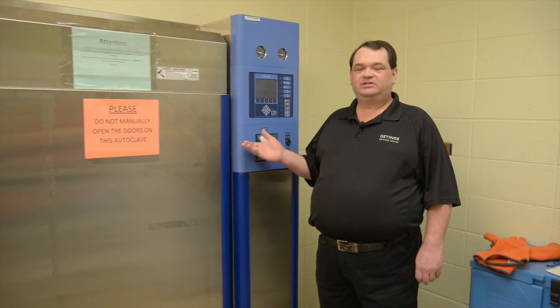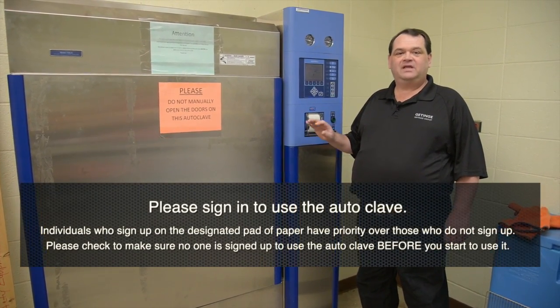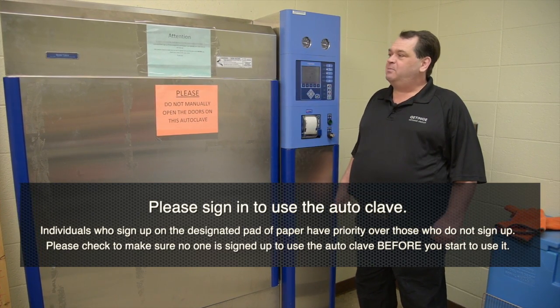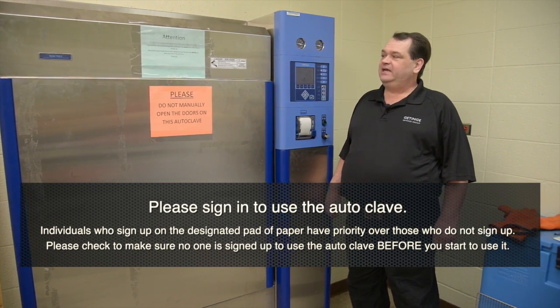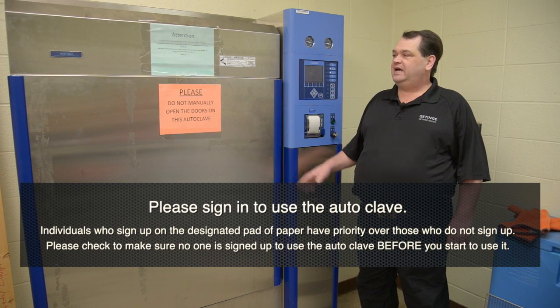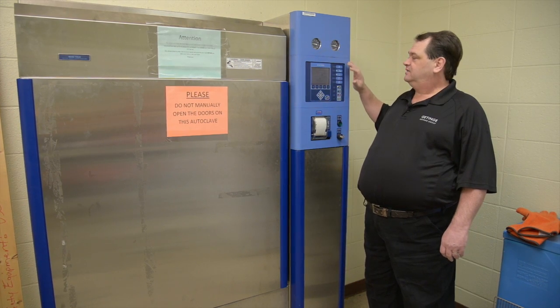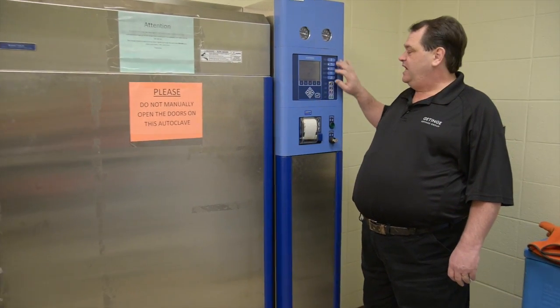Hello, my name is Gary Wood. I'm a Life Science Service Rep with Getinge. We're here today to go through the safety videos for operating the equipment in a safe manner. The model we're looking at today is a model 733 LS. The 733 LS has a power open door, mechanical gauges, the display panel, and the operating buttons. We're going to go through how everything works on the autoclave and how to operate it in a safe and proper manner.